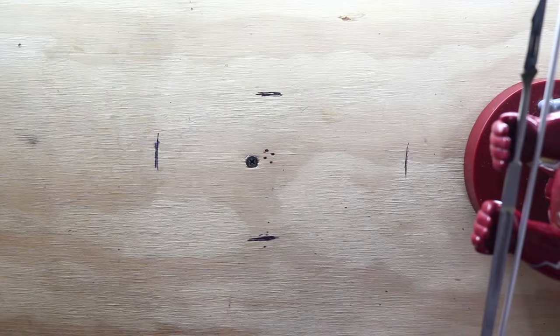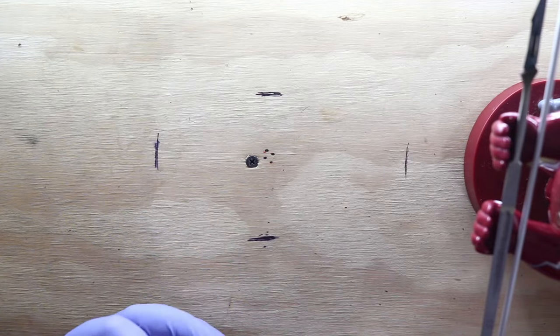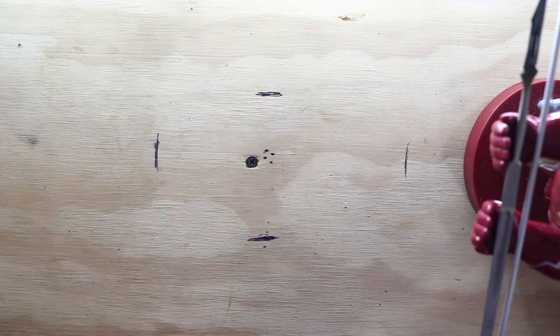Undone says, I was talking about when I biopsy flesh of the mushroom and put it in the dish, not from the dish, same technique. Yeah, it's roughly the same thing. You still want to do more of a smush. I guess that's really all I've got here at the moment, Samantha.